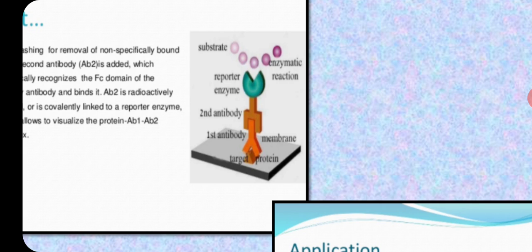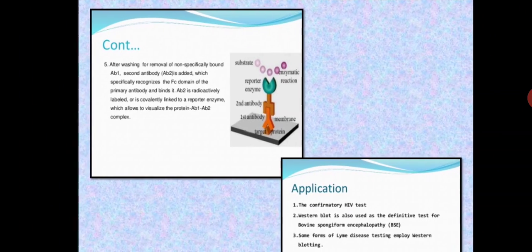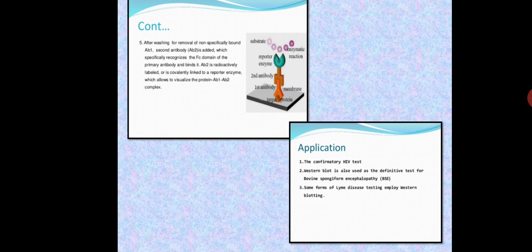Okay, so this is a simple technique, western blotting, and it's different from northern and southern blotting. In SDS-PAGE the molecules were being separated, and the process is different from northern and southern blotting, because in northern and southern we use agarose gel, and in this we use SDS-PAGE. So this is a simple method, we will quickly understand it diagrammatically.